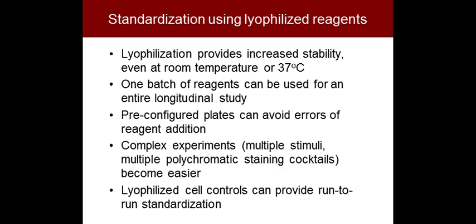Lyophilization can provide increased stability so that you could create a bunch of cocktails that are lyophilized and keep them even at room temperature for a long time. We've used these things out to 2 years and more. And that way you can have one batch of reagents that last you for an entire study. It can be done from a couple of different vendors now as pre-configured plates.